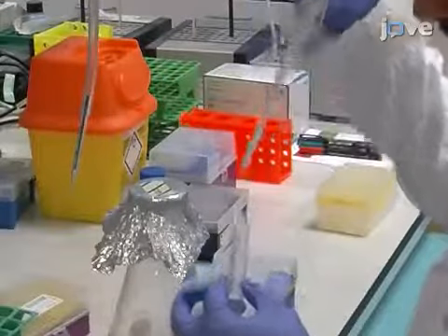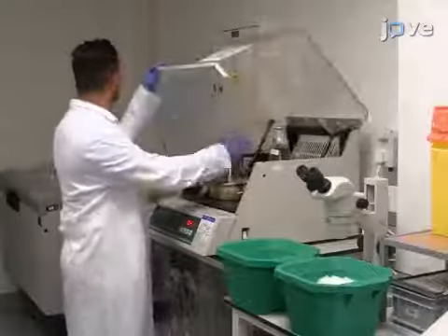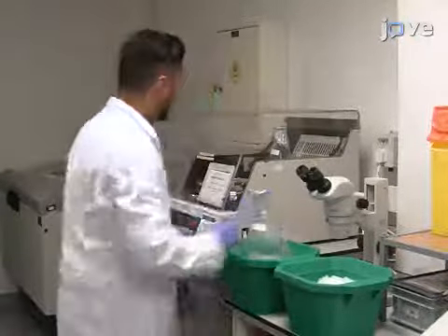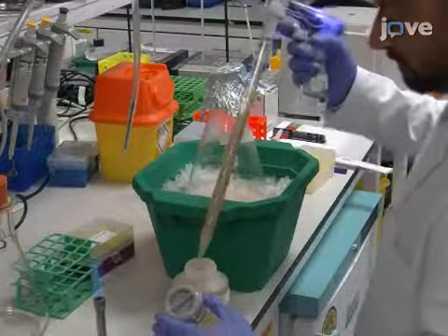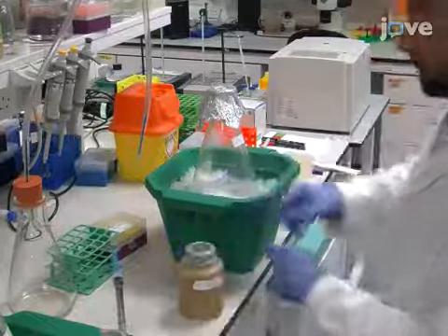Next, supplement the cultures with 50 micrograms per milliliter of streptomycin. Then shake the flasks for an additional 30 minutes at 37 degrees Celsius before placing the flasks on ice for 15 minutes. Transfer 450 milliliters of each culture into separate 500 milliliter sterile centrifuge bottles. Retain the leftover culture on ice as it will be used to determine the concentration of the bacteria.